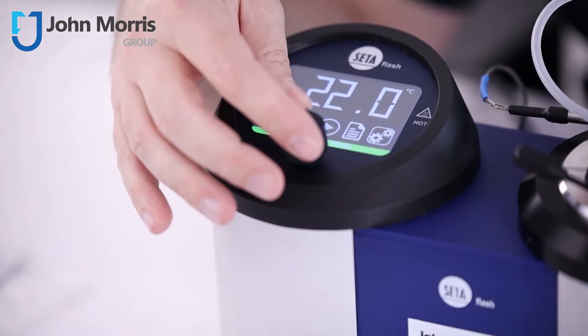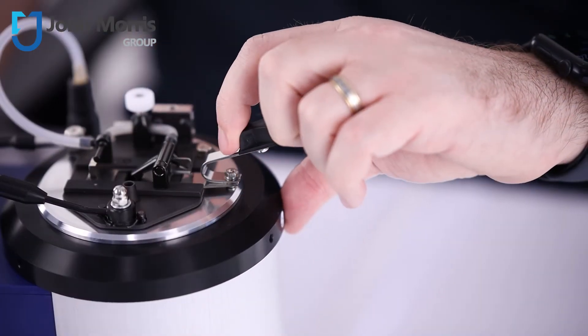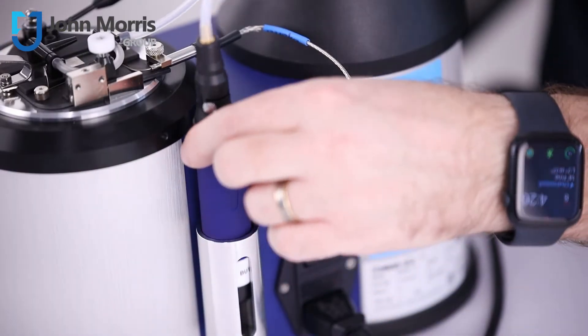This unit provides a fast and reliable flashpoint result in conformance with common ASTM methods such as D1655, 3278, and others.